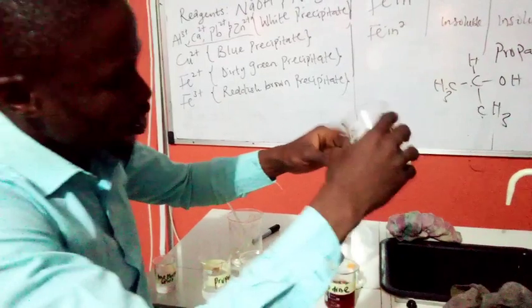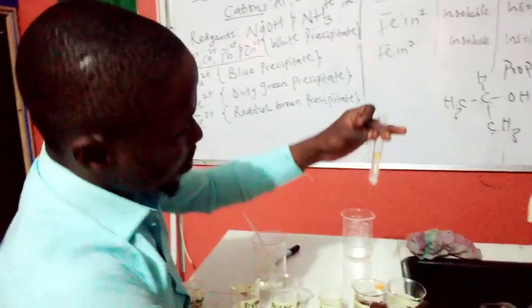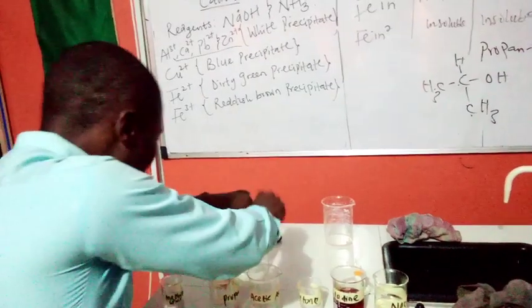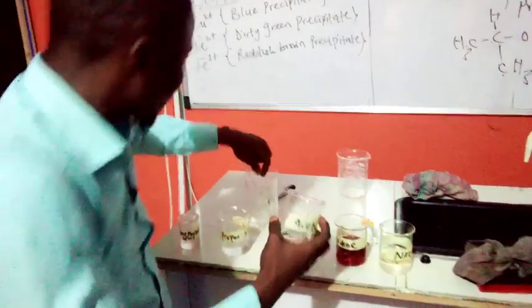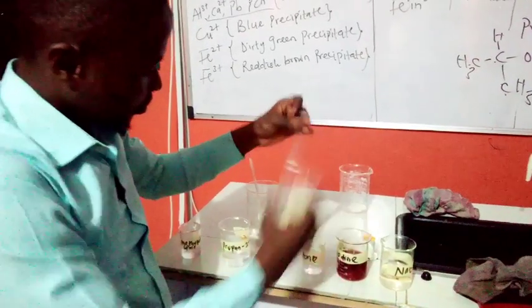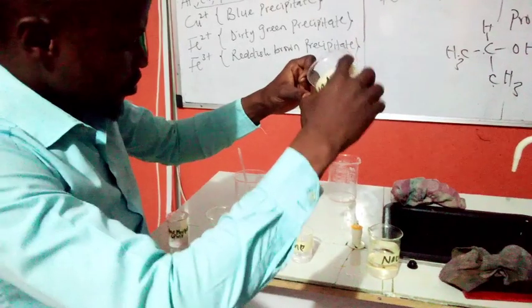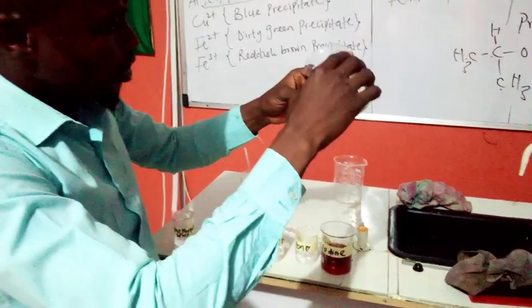And we had our sodium. As you can see, it's completely colorless. Then we can add our acetic acid. I think I've not added the acetic acid. And this is my 10% iodine solution. And I'm going to add my sodium.